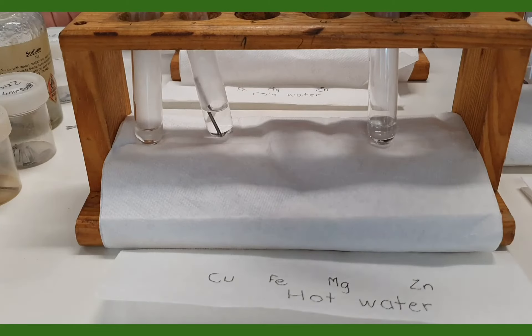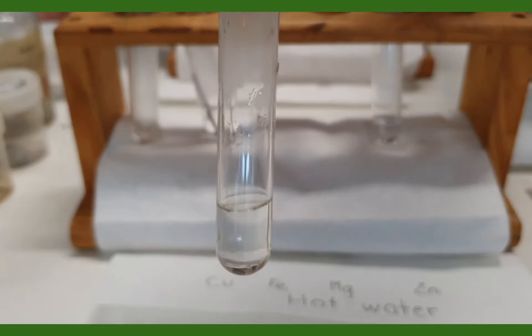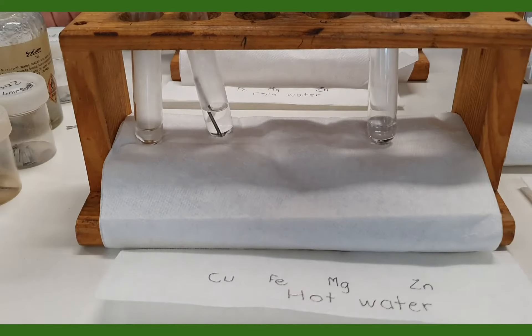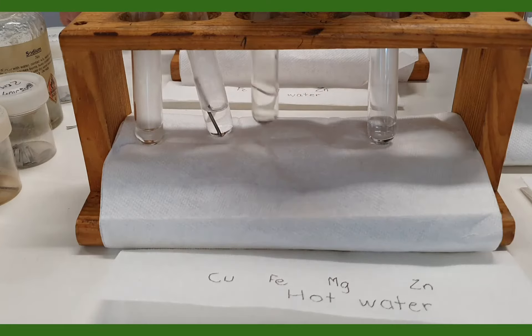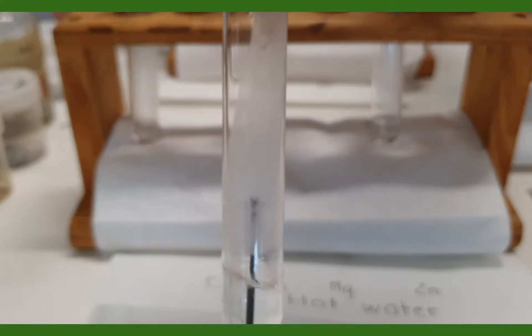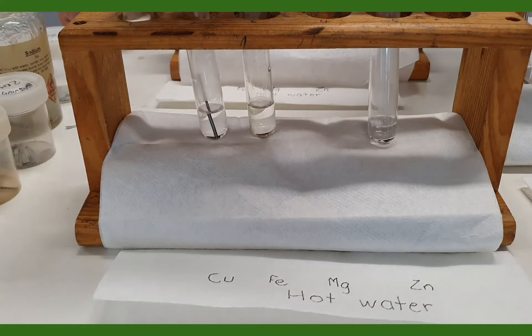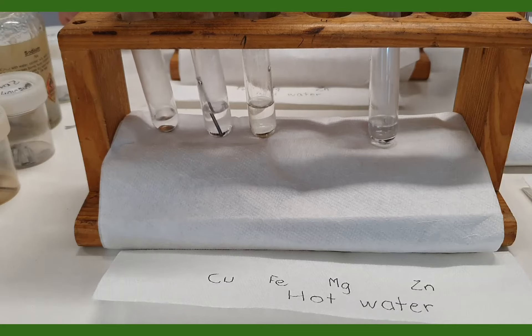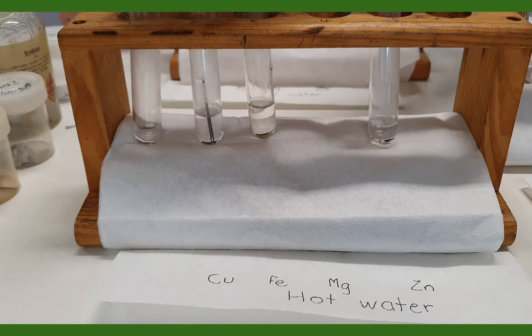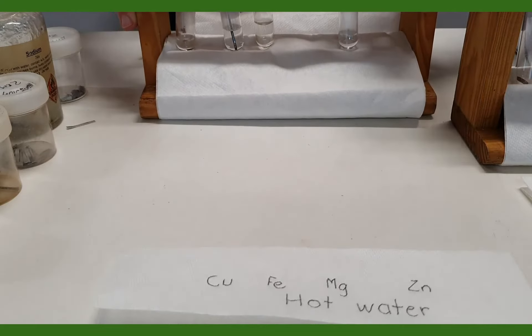This is magnesium, and there doesn't seem to be any reaction there. Iron doesn't seem to be any reaction there either. And finally copper — we might expect no reaction. We'll just leave that for a little while and see if there does start to become a reaction. In the meantime we'll have a look at the action of cold acid on each of these metals.